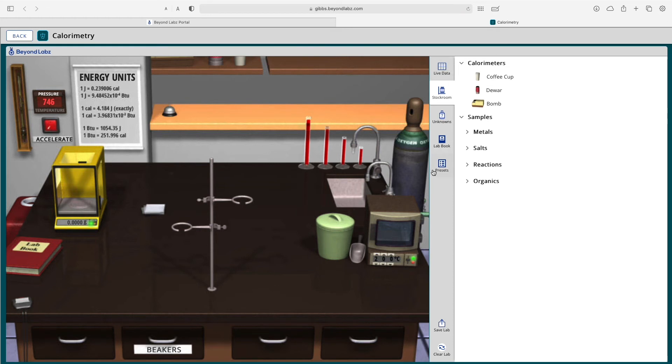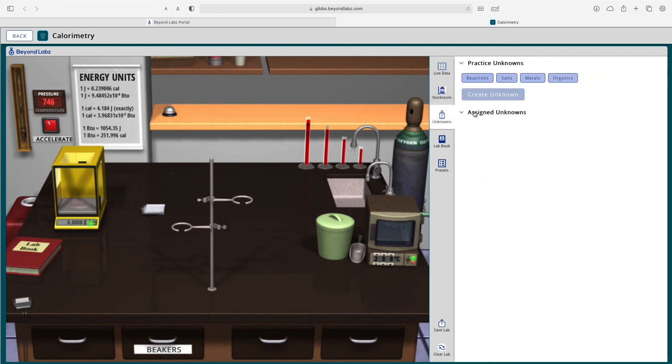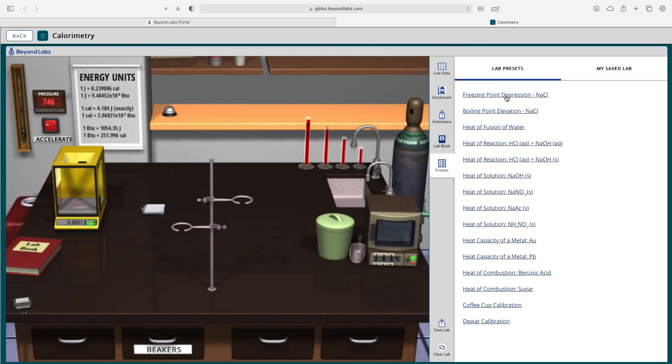On our system tray here, you can view live data, access the stock room, create and use unknowns, access your lab notebook where you can write notes, and access any presets.